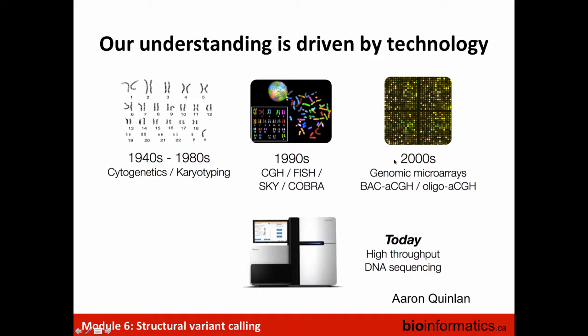The microarrays were used quite extensively, especially to detect copy number, and that's what I'll show now. But then with next generation sequencing, and that's going to be our module, in theory, we'll really be able to do a much, much better job at detecting these structural variants.